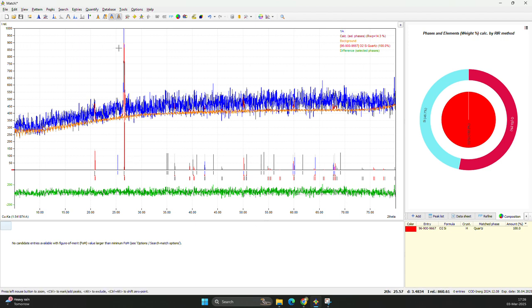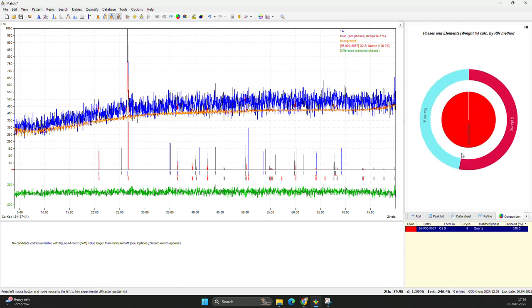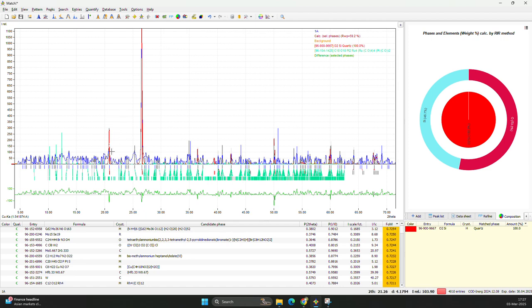and this red will show the quartz. You can see it shows the quartz, and then you can go to this option, and it will show how much silica and how much oxygen is present. By clicking this option, overall it will be in the base form, and all the data will be in this XY coordinate.